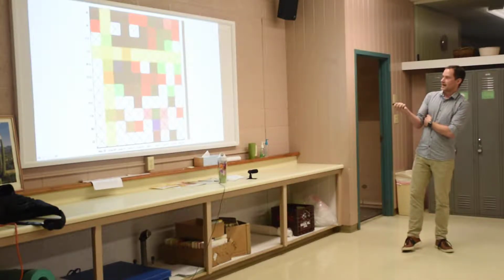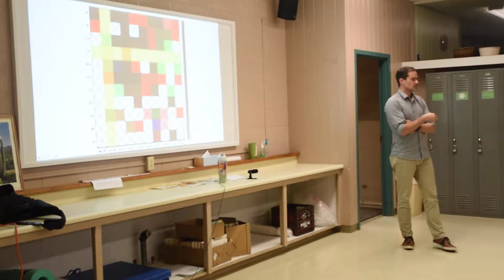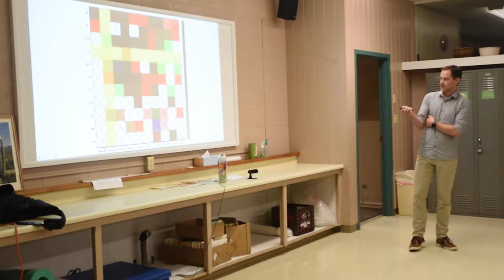And then at I-15, you look and we have only one time point where we actually have any swimmer's itch at that time point. So if I was to say, where am I going to swim on this lake? I'm going to I-15.